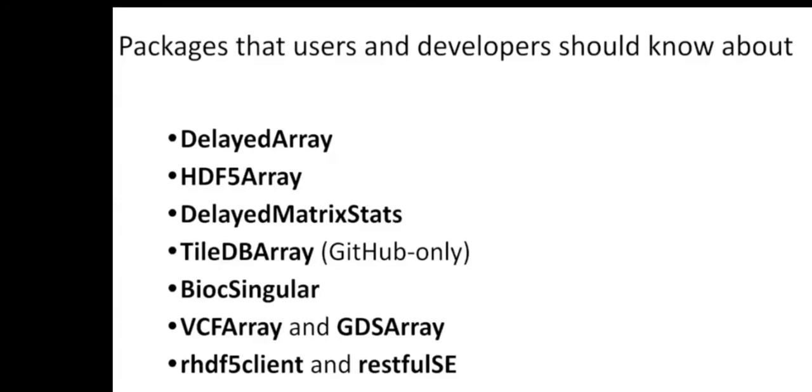The TileDB package, which is not yet available through Bioconductor, provides another on-disk backend for working with large data sets that is compatible with DelayedArray. The BiocSingular package allows you to perform singular value decompositions or principal components analysis of these delayed arrays. The VCFArray and GDSArray packages have a different focus, looking to store genotype data on disk and accessible via the DelayedArray framework, whilst the rhdf5client and restfulSE packages focus on using remote data stores, such as an HDF5 file stored on a server, and interacting with it via the DelayedArray framework.